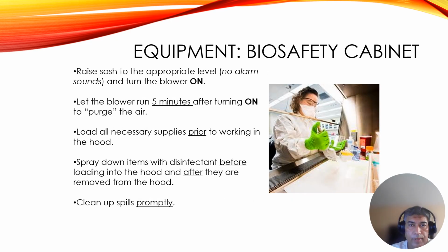Now, how do we operate a biosafety cabinet? Raise the sash, that is the glass door, to the appropriate level. There are marks on both the left and right sides of the glass holder. If you go beyond those marks, the equipment will start beeping.